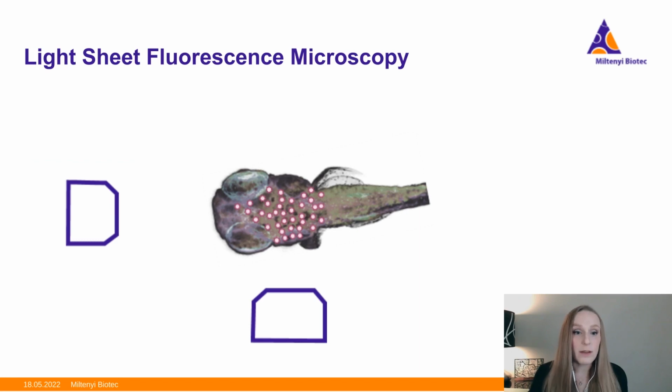So, I'm going to be focusing on two aspects of that. I'm going to be focusing on both the light sheet microscopy and then also the high content side. And so I'm going to actually start here with the light sheet fluorescence microscopy. Now, some of you may have already used this particular technique in different platforms. However, I'd like to just spend a few minutes explaining what goes on in this particular technique so that we can appreciate where we put in the automation later on.